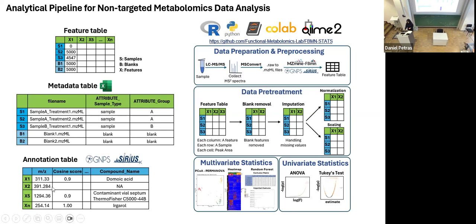And then in addition to that, we also get these GNPS annotation output tables, which is how this looks. You have these unique IDs, like from the Marcus session, and also Daniel, have this feature ID, like the unique ID, the scan ID that you get from MZmine as well as from SIRIUS. They all share the same ID with which you could combine them into kind of a master table so that you have all the information, feature intensities, and then if they have some annotations, all those things in addition to the m/z and retention time.